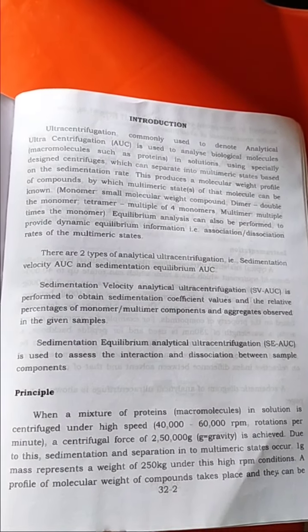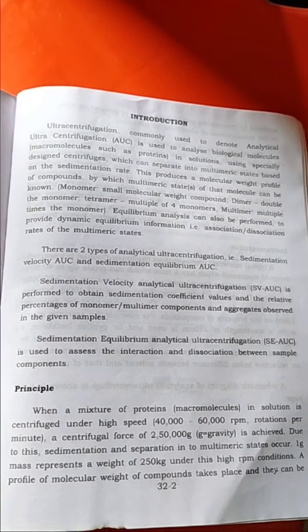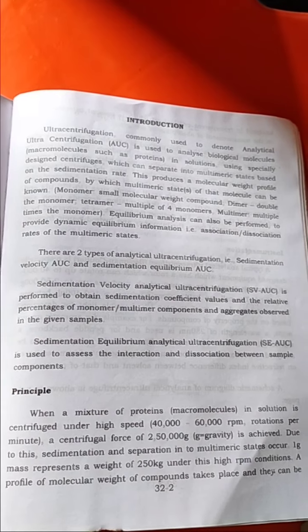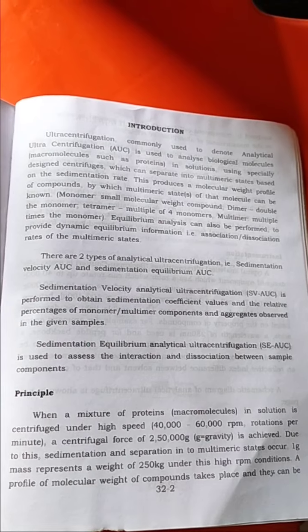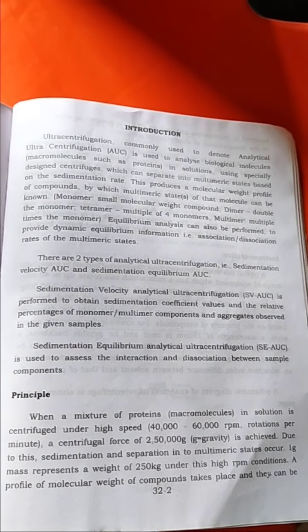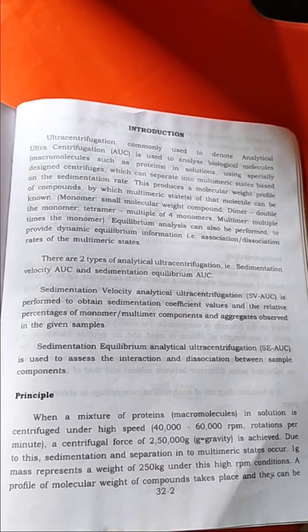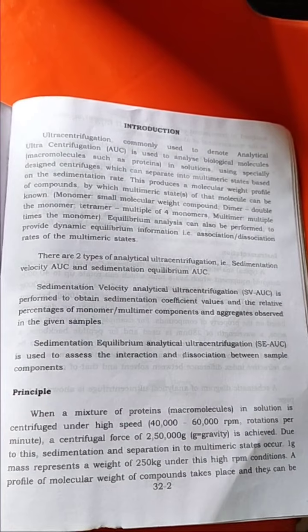Due to this, we apply a centrifugal force of 250,000 g to a solution at high rpm, 40,000 to 60,000. Sedimentation and separation into multimeric states occur.